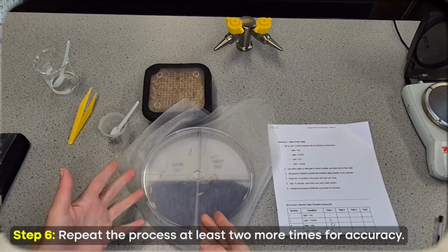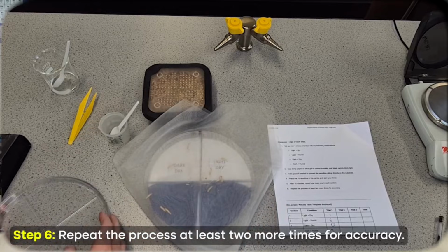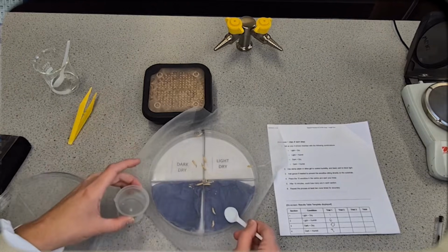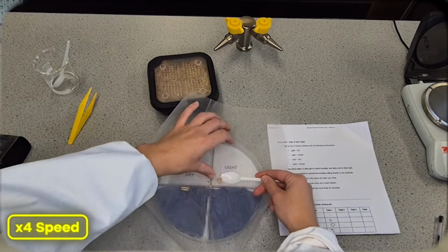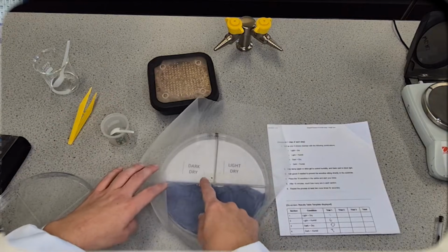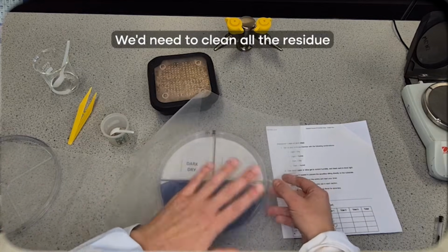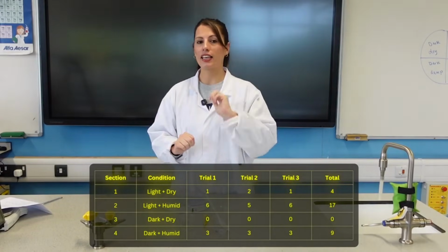I'm not going to repeat all of that because we've seen how we've done it, but we can just have a little look at how the students can then carefully return the maggots. They will need to move quickly with this because they're going to be pretty quick movers. Okay, so that's my 10, but as we can see, we do have residue here. So we'd need to just clean that in between. They could just take that to a sink or a bin and just shake it down and give it a quick wipe.